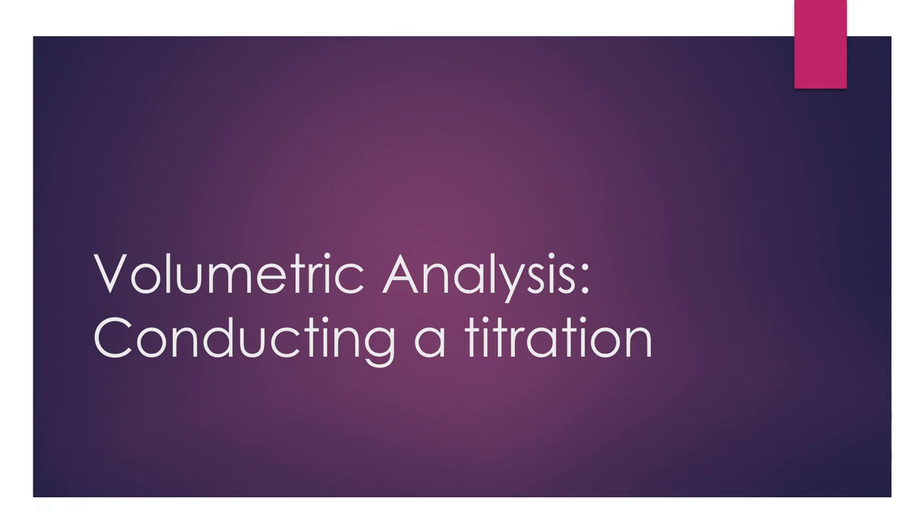Hi and welcome back. In this video we're going to go through the ideas of volumetric analysis and conducting a titration. This is an experimental technique that allows us to identify the amount of an unknown substance in solution by reacting it with another solution. For the next few minutes you'll watch through a video from the Royal Society of Chemistry that shows how a titration is conducted.